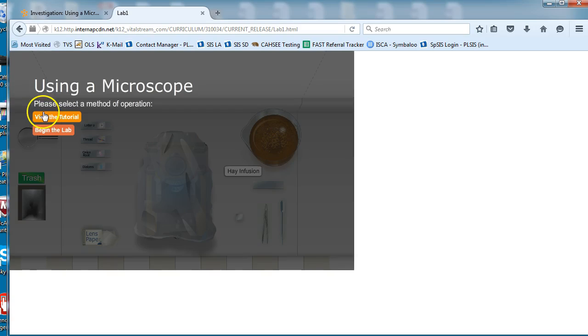Okay, so it's going to be helpful for you to view the tutorial as well, but today I'm not going to go over the tutorial. I'm just going to go ahead and help you begin the lab. So you'll press Begin the Lab.